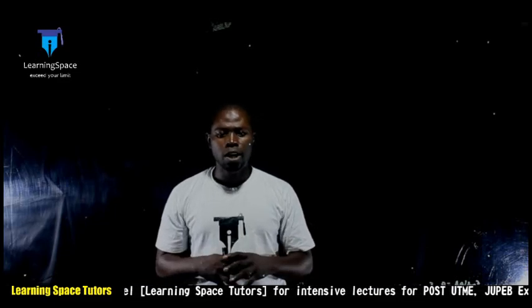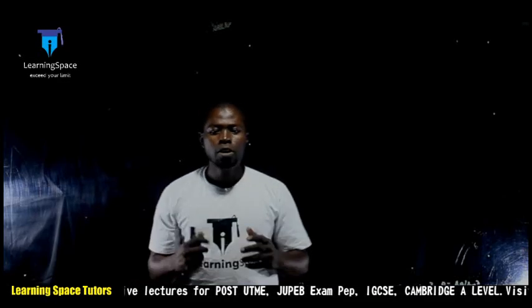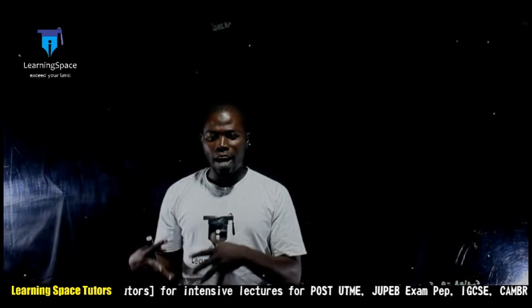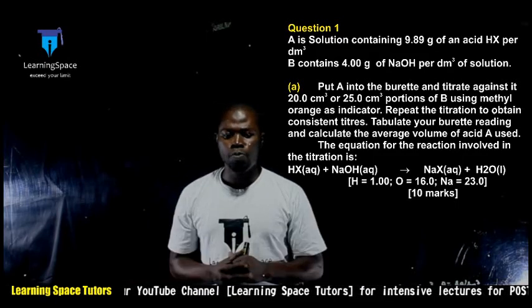I will start with the titration questions, like titrimetry when it comes to a real practical. Now, for the majority of exams at O level, question 1 is usually titrimetry, that is on titration, where you have an analyte and a titrant. The analyte is what you are analyzing. The titrant is the standard solution that you are trying to titrate against the analyte to get the standard concentration. Now, let's go to a specific question.